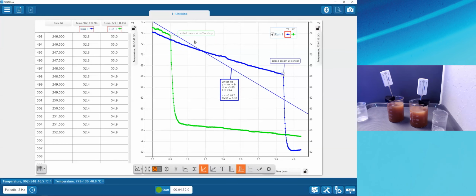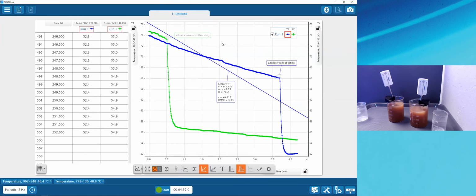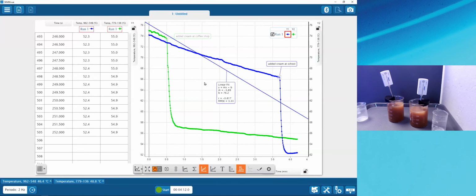And I have a bit of a dilemma because my cursor by default is not a selector, it is a mover, as we saw earlier. But I can use one of the tools in the graph toolbar to change my cursor into a selector. It is this toggle called the toggle move select mode, and you'll see that the move mode is the default. So if I click on it, it will change to select mode.